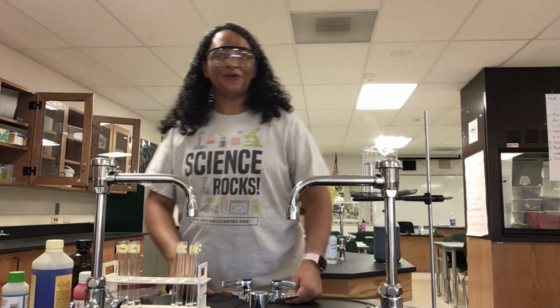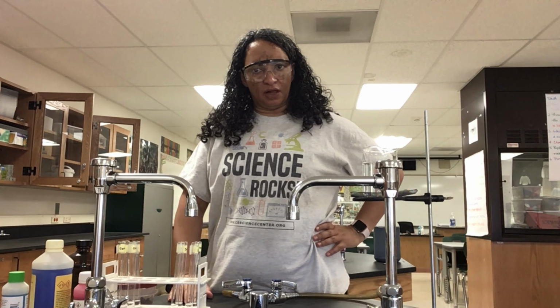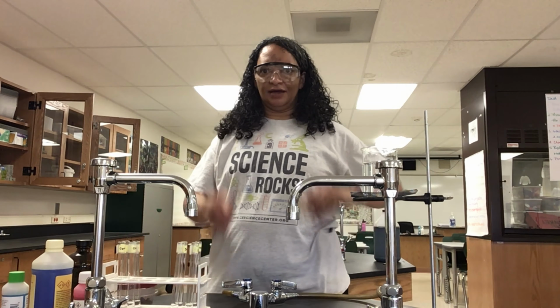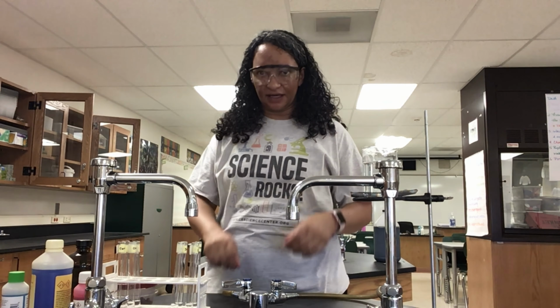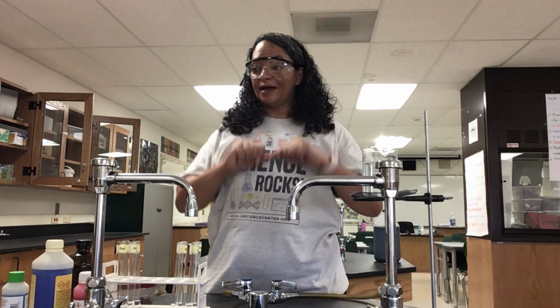Focus. So welcome to the lab today. Today we are going to be testing what type of macromolecules can be found in a seed. And I'm just realizing that my safety goggles are reflecting the light, so I will do my best to make eye contact with you while I do this, but got to keep my eyes protected while we do this.